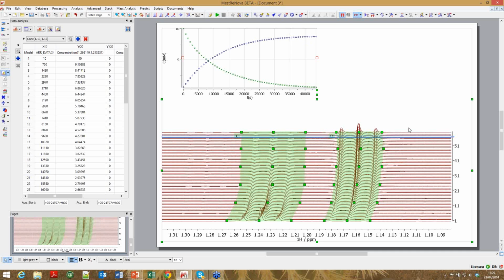The other thing that you can change is the left and right edges of any particular handle. So if it turns out that you had another peak sitting over here that was getting in the way, you could move this out or move it in more snugly with multiplet or something like that. So you've got quite a bit of leeway as to the way in which you use these and drag them around and select your regions, and this makes it quite powerful, really.